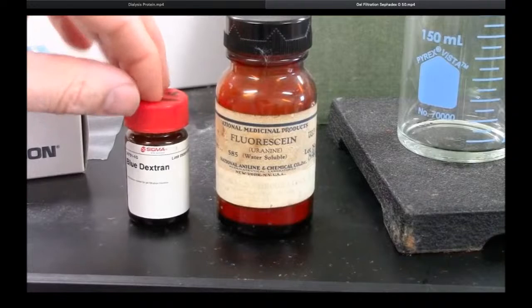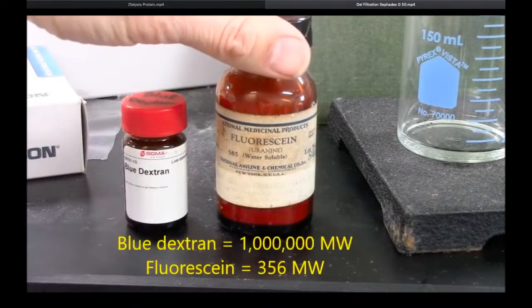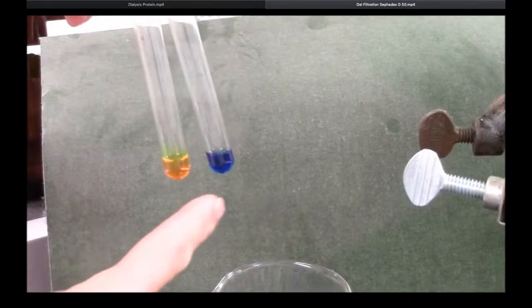I'm going to put a mixture of two molecules onto the column. Blue dextran is a very large molecule. It's a polysaccharide. Molecular weight about 1 million. Fluorescein, on the other hand, is a small molecule. Molecular weight about 350 grams per mole. I chose these two molecules because they're nicely colored, so I'll be easily able to see the separation visually as they go through the gel filtration.